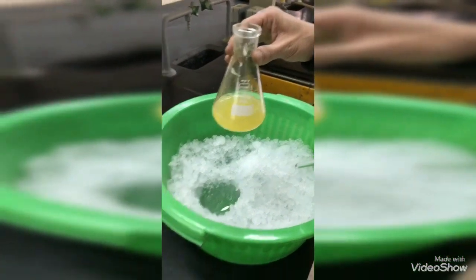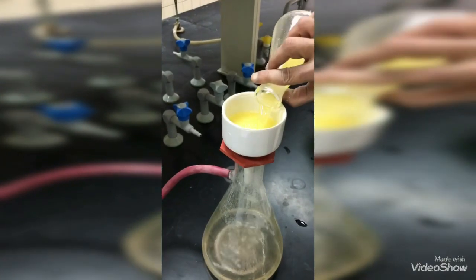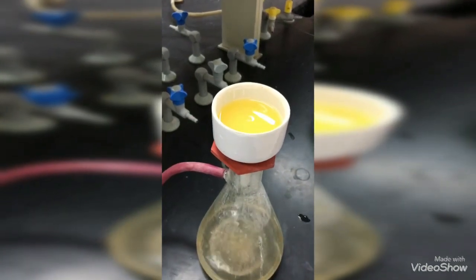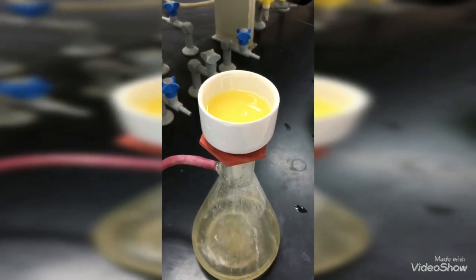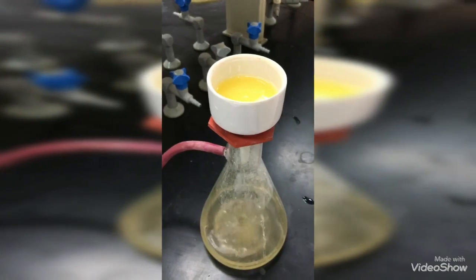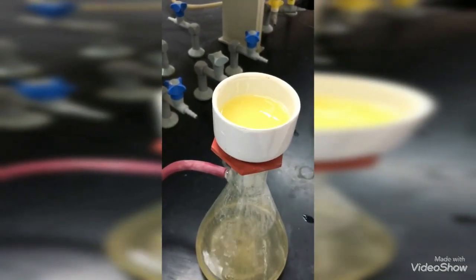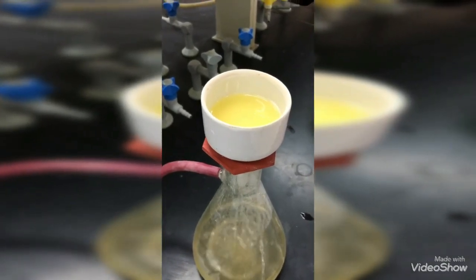Now start filtration. Make sure to rinse the flask using cold water and continue filtration.